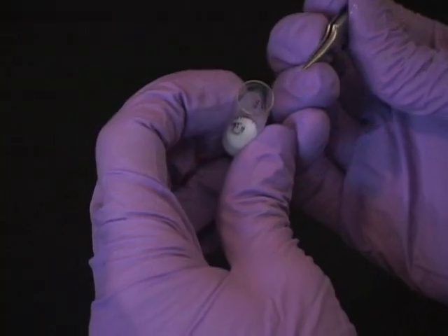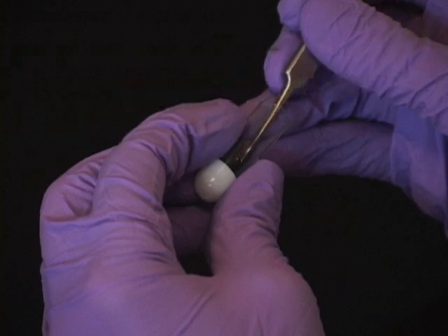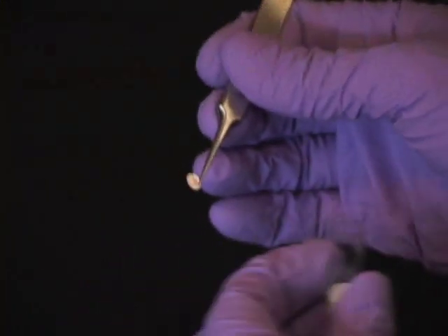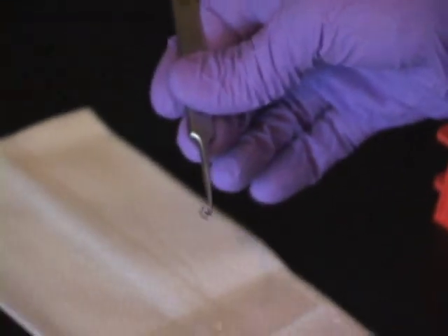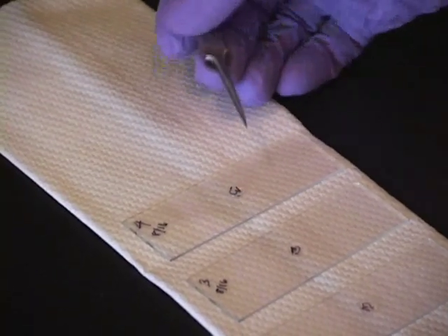With forceps, remove the coverslip and invert it onto 5 µL Citifluor on a slide. The number 3 on the coverslip should now look like a 3.